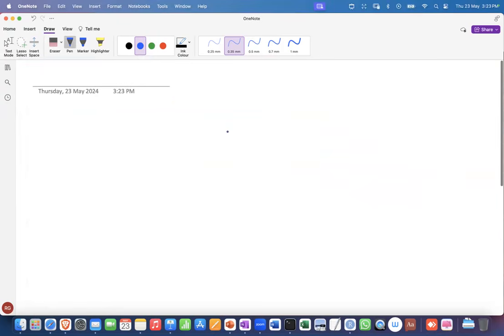Now, one of the major interpretations of your analysis is by looking at your Bonferroni correction. Guys, because of lack of technology or certain statistical tools, some people do not go in for Bonferroni, but I prefer that you always select those SNPs that cross the Bonferroni threshold value of 7.3. That is one major thing.